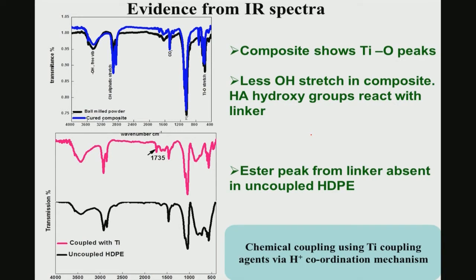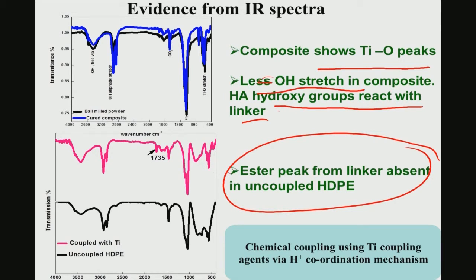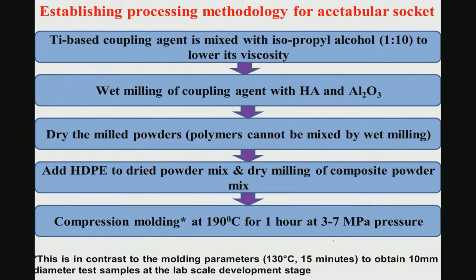Once you do this powder mixing and ball milling with the coupling agent and the high density polyethylene, it shows a titanium and oxygen peak and a less prominent hydroxyl stretch peak. That essentially shows that the hydroxyapatite hydroxyl groups react with the linker. One can also notice the ester peak here, which is absent in the uncoupled HDPE. As far as processing is concerned, one can use 2% or 3% of the coupling agent, and isopropyl alcohol is the medium to mix the coupling agent with the powder mix.